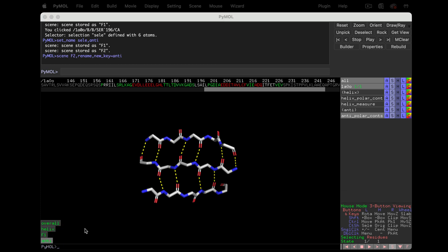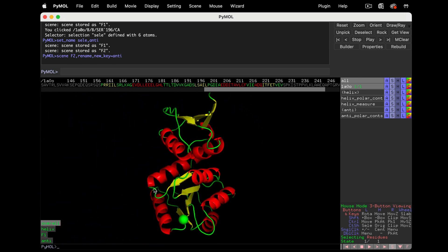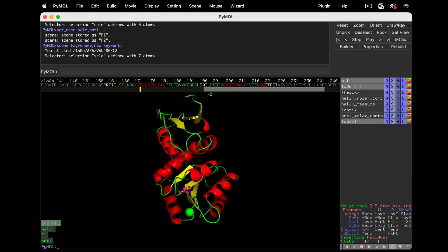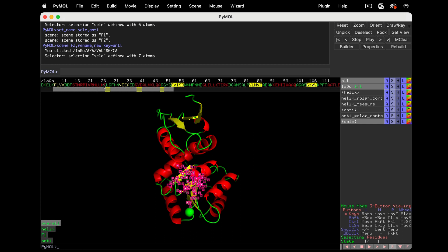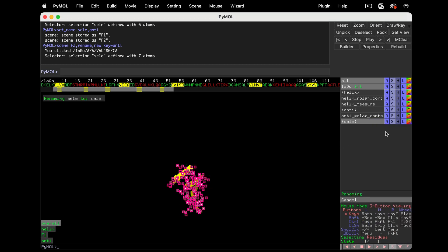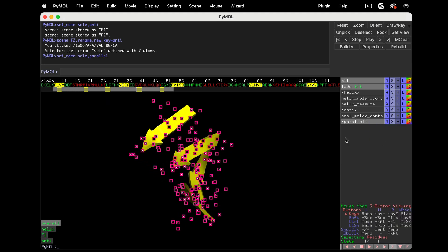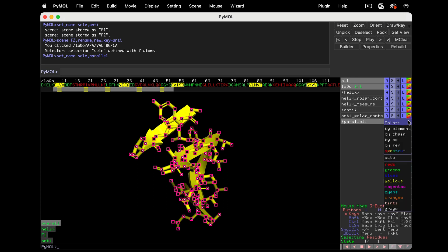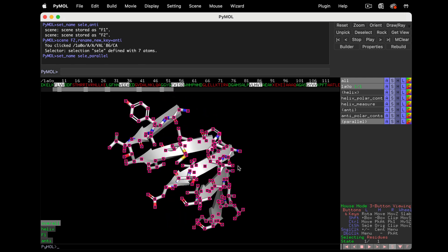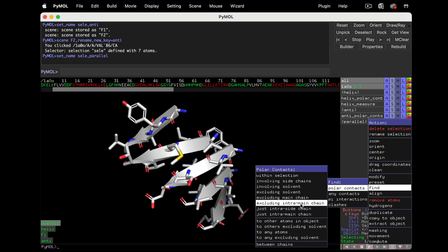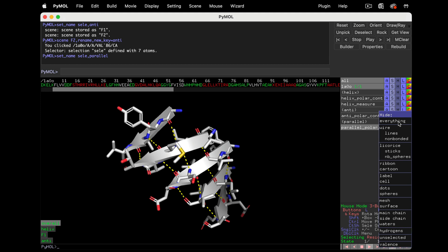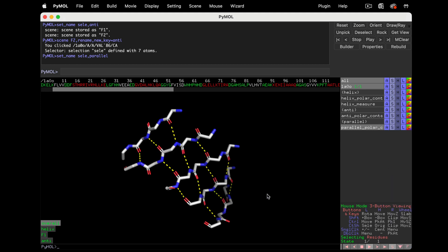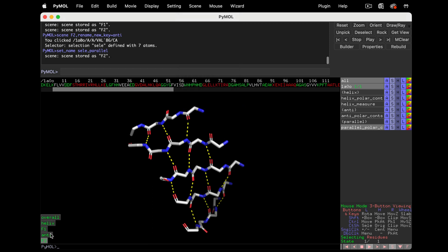Onto the parallel sheet. Return to our main scene and click on a residue within it. Find it in the sequence and then select all yellow residues in chain A. Hide unselected. Save the selection by renaming it, and then zoom. Show sticks and apply CPK coloring. Again, we'll use polar contacts to show the hydrogen bonds. Actions, Find, Polar contacts, Just intra main chain. Hide the side chains and hide the cartoon. Now save a scene called parallel.